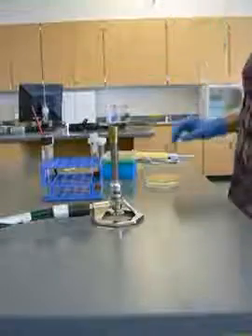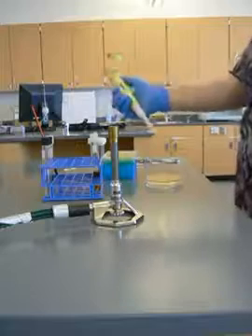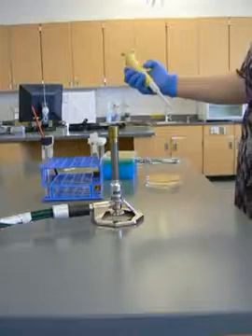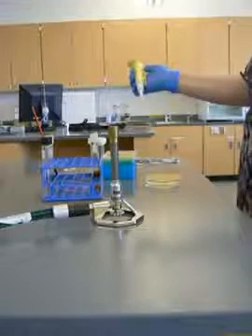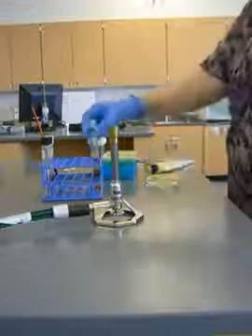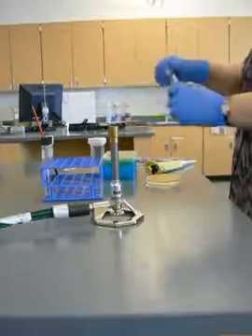I'm going to demonstrate how to do a spread plate. I'm going to need my micropipetter, which is set to the amount that I want. I've got 10 microliters — that's what I want. I've got what I'm going to add to my plate, and I've got my microbes in here.